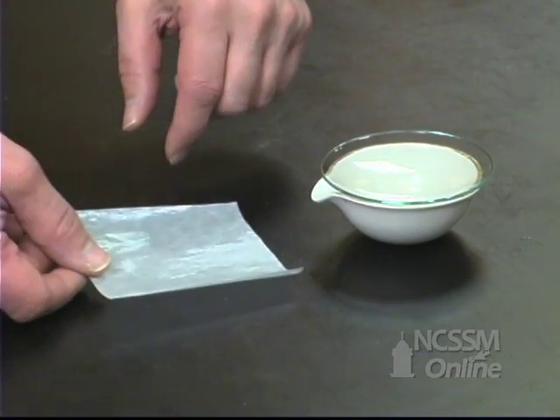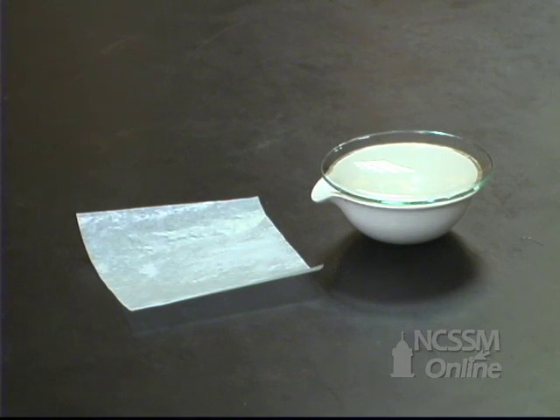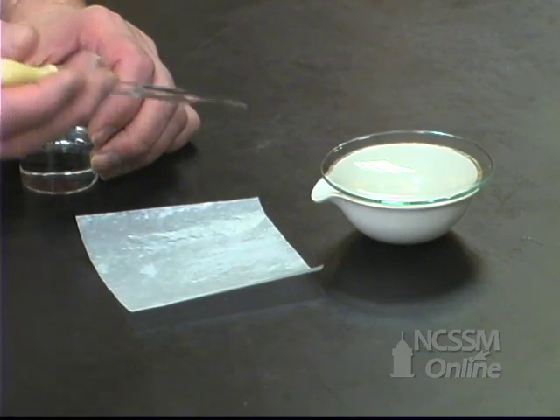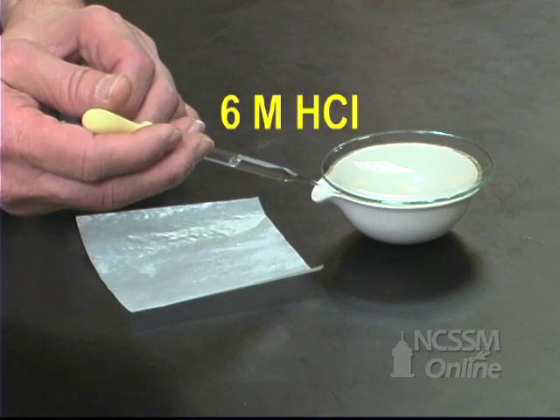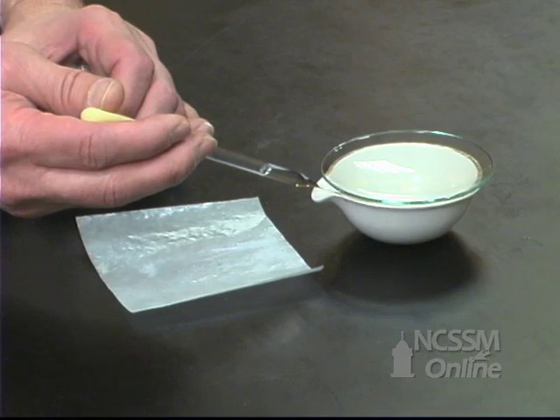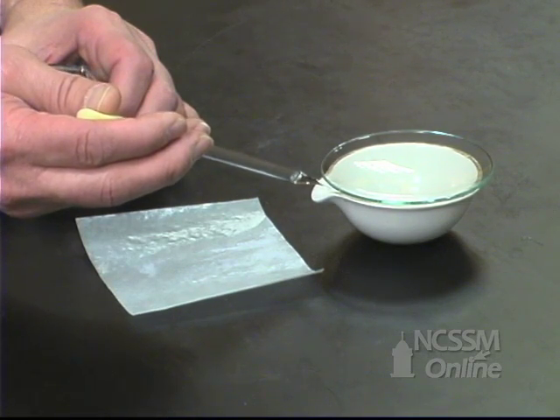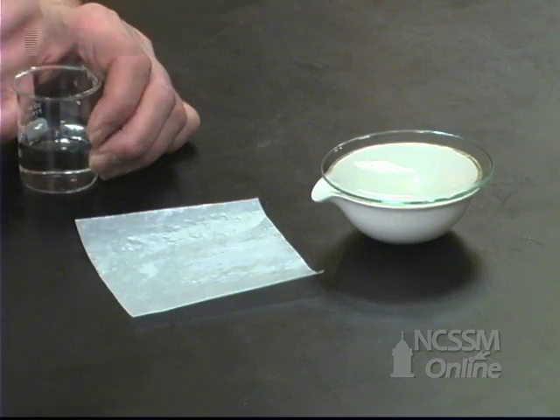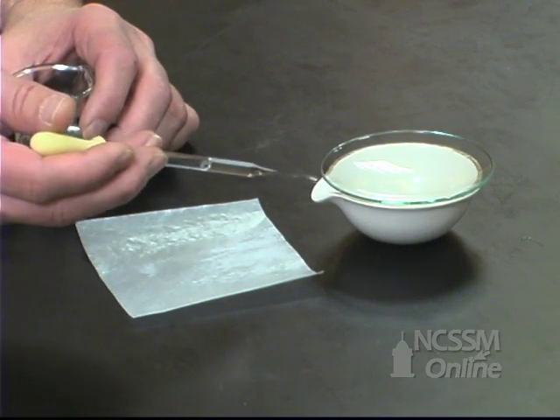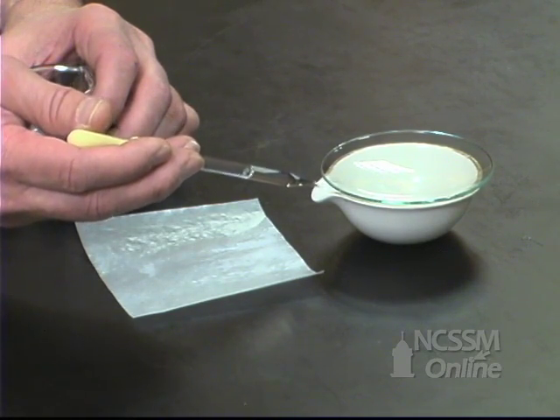We cover it. We're now going to slowly add hydrochloric acid to the mixture. The hydrochloric acid will react with the sodium hydrogen carbonate and the sodium carbonate to produce water, sodium chloride, and carbon dioxide gas. The carbon dioxide gas will escape from the reaction mixture. The watch glass prevents any loss of compound from splattering.